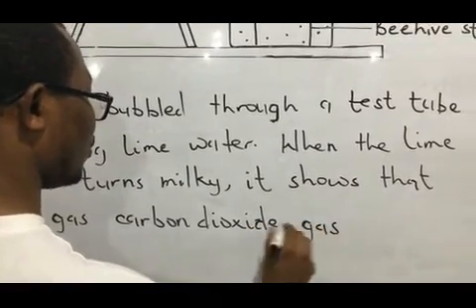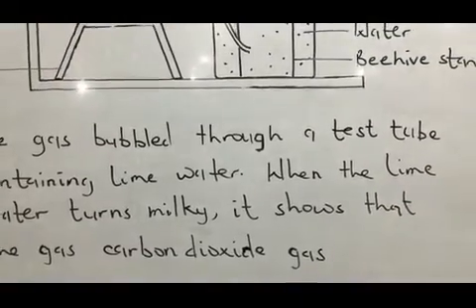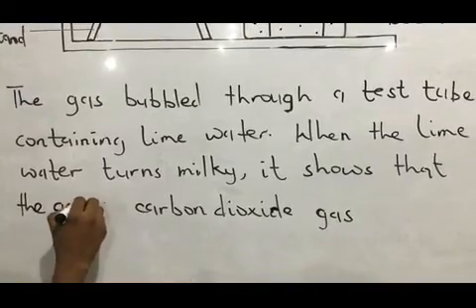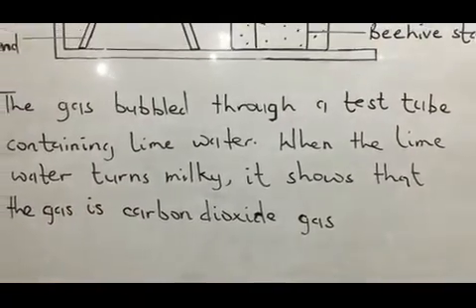Okay, so the gas is carbon dioxide. So the gas is carbon dioxide gas.